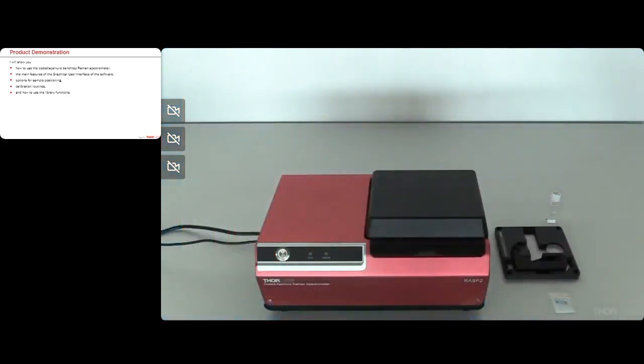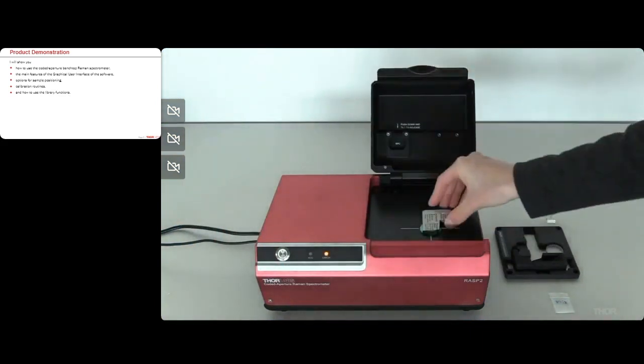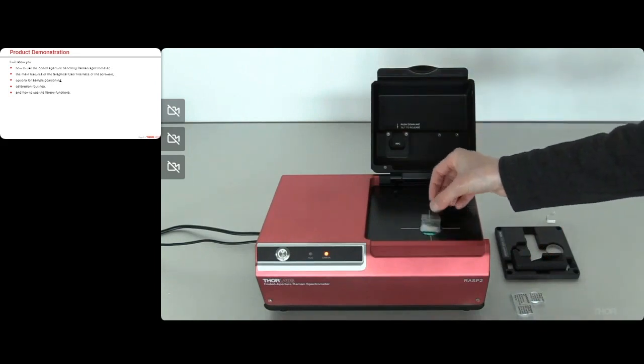We will now move on to our final measurement for today, for which we will use the example library to identify a mixture of components. First, we position the sample of choice on the measurement window and close the lid.